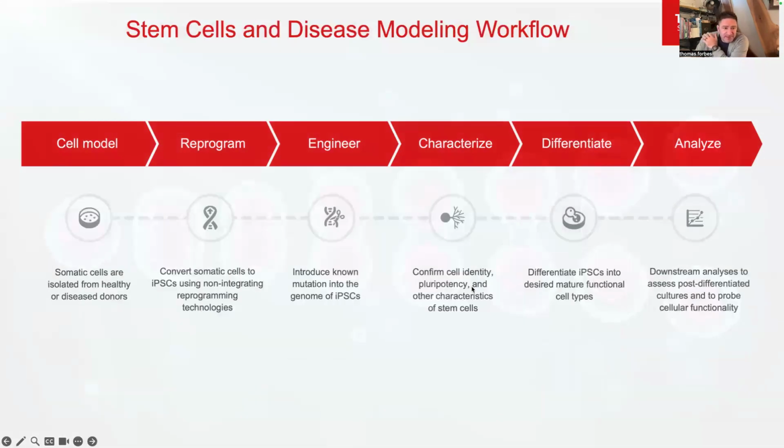So I'm going to wrap this up here. But again, I think we're in such a good space and such an interesting space as well, working in stem cells. We've got all these new technologies at our fingertips, which is so, so cool, all the way through the workflow, right? For the generation of iPSC systems that allow us to nowadays create these limitless pools, if you will, of iPSCs. The iPSCs obviously contain some of the genetic makeup of the cells from which they were derived, but we can then use them with tools like gene editing, right?